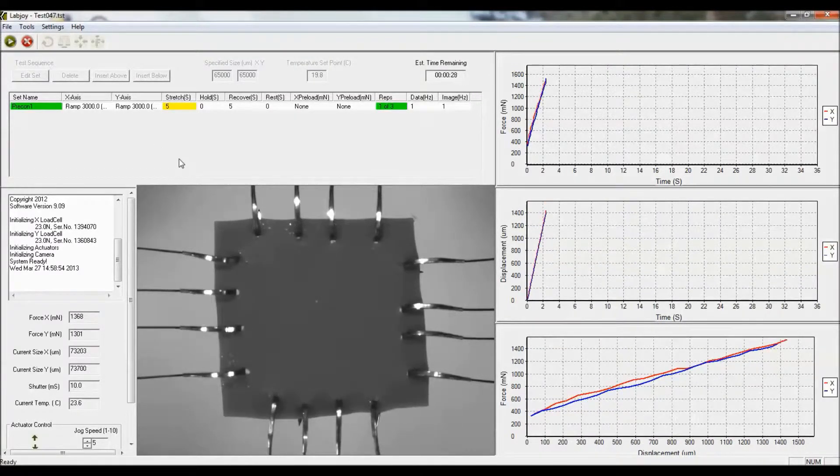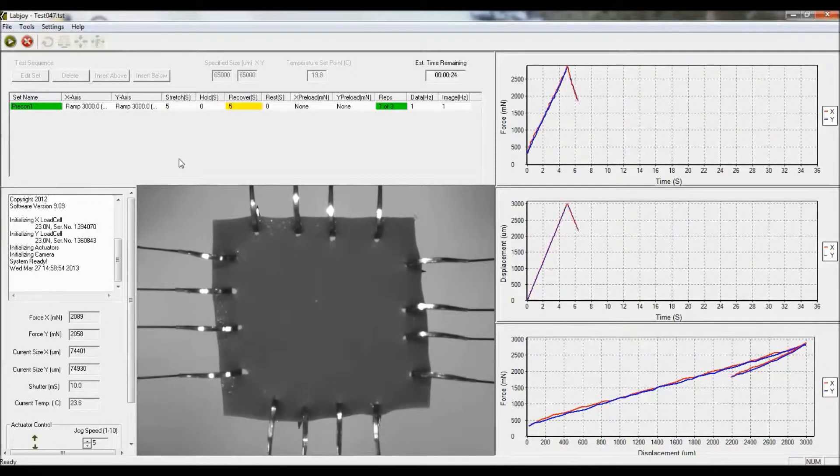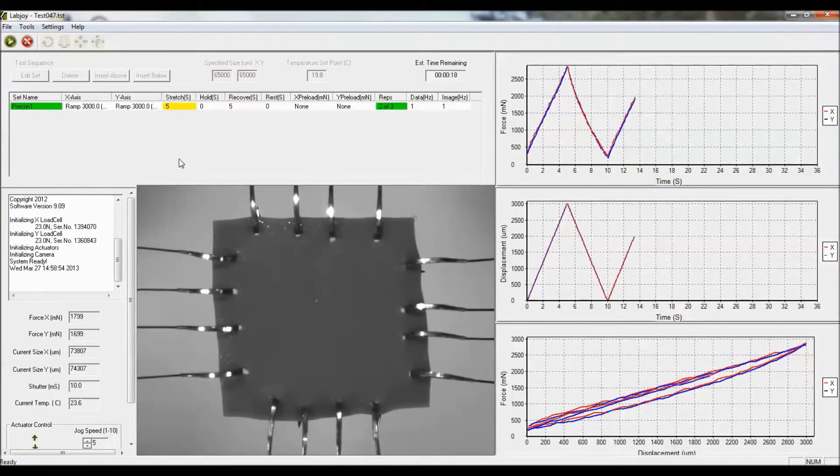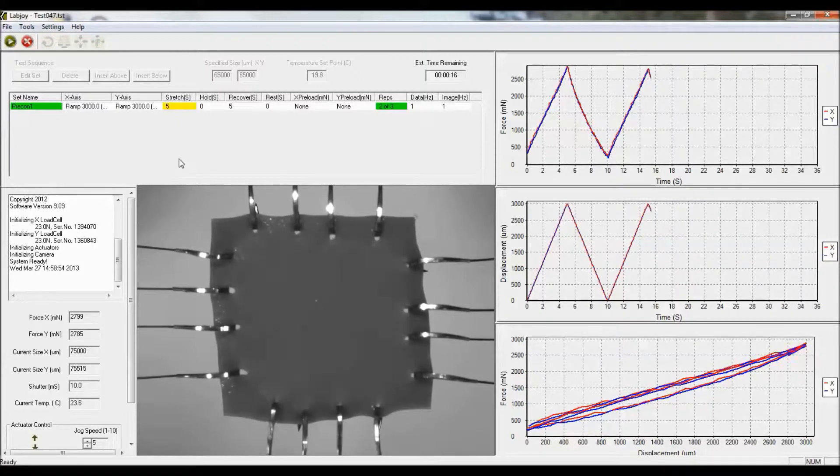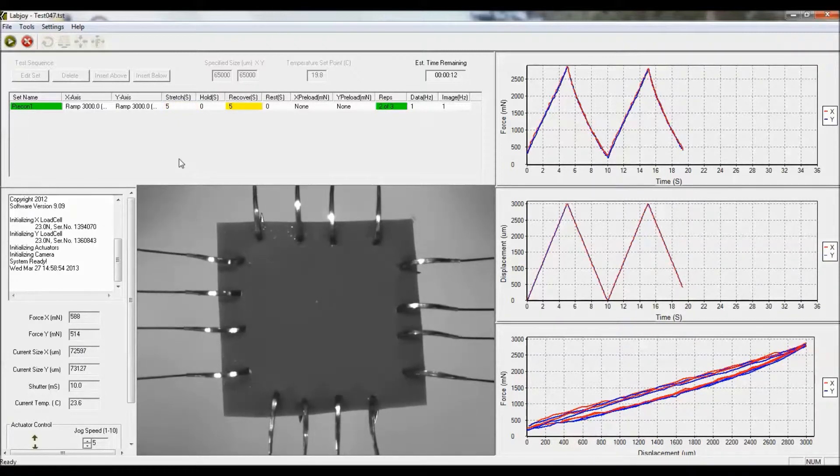And what we'll see on the right-hand side of the screen is the force versus displacement curve. In this case, we're going up to just under three newtons of force with our three millimeters of displacement. There is an isotropic material, so there isn't a lot of difference between x and y. And there's a little bit of a hysteresis loop, but it's pretty flat.